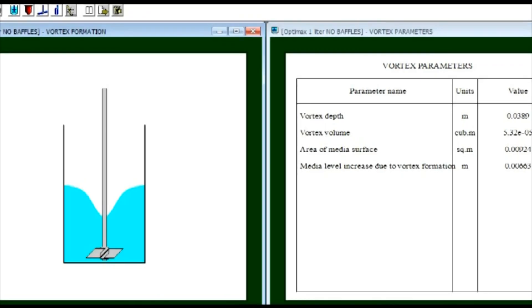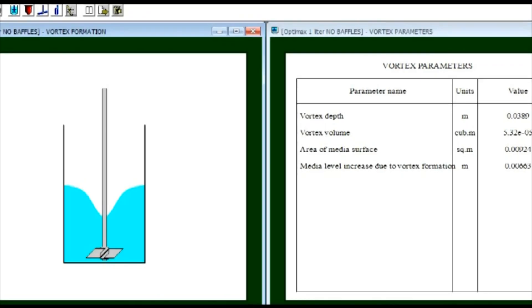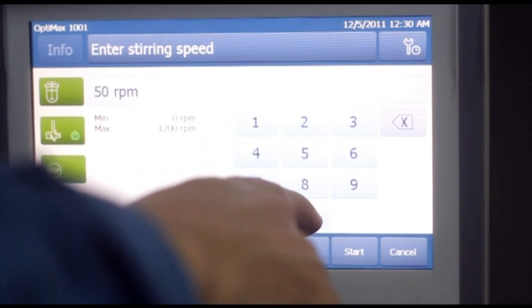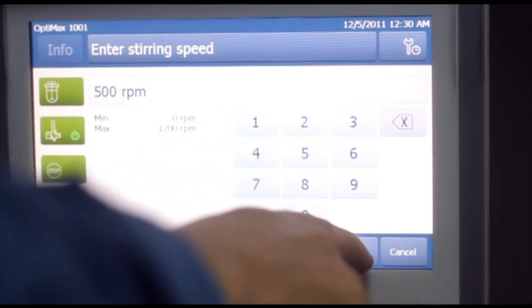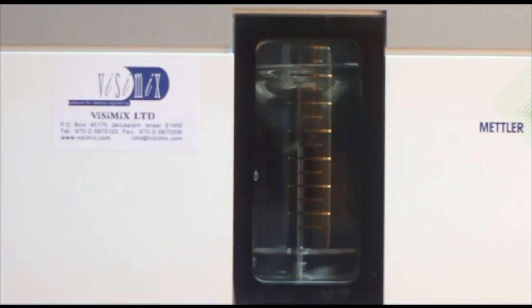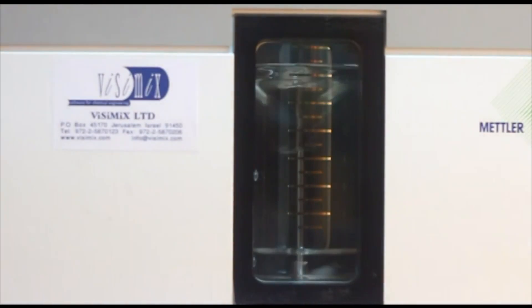Detailed experiment information is stored and displayed as the experiment proceeds. In this first example using OptiMax with VisiMix, we find a deep correlation between configuration of the experimental equipment and hydrodynamic performance.